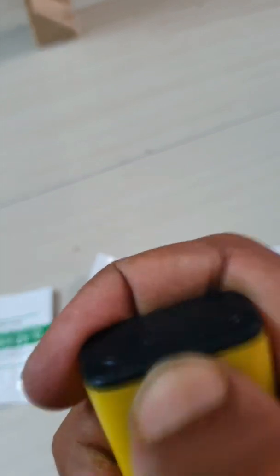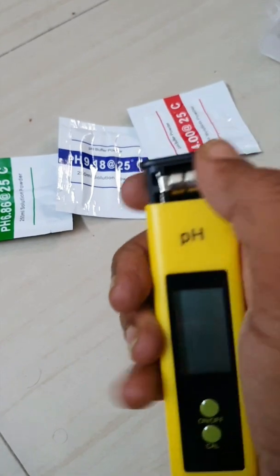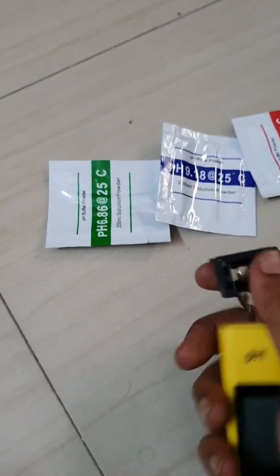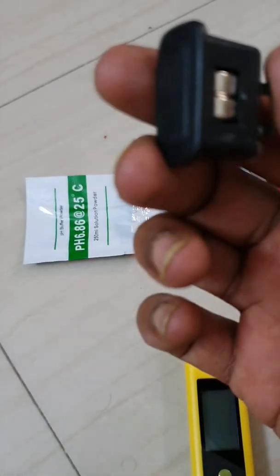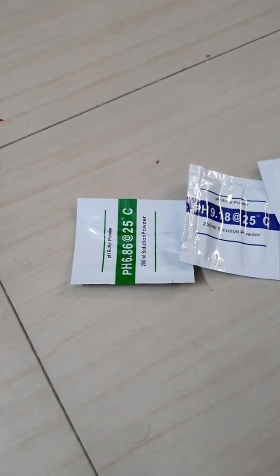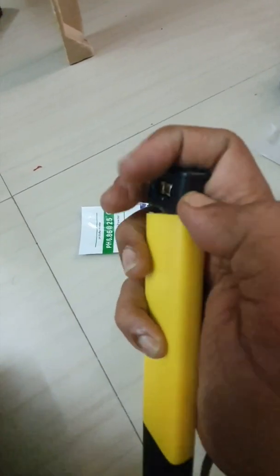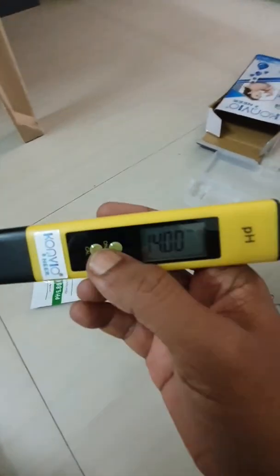Let's open the battery compartment. There are two batteries — as you can see, it's already preloaded. You can change them once they're exhausted. Let's put it back and keep looking at the meter. We have the on button over here.